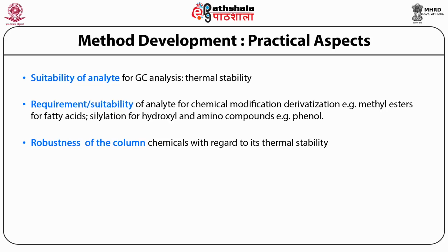determined. And again, there is a wide range of chemicals now available which are part of the column, and the thermal stability of each of these varies. So if the program that is to be run for a particular mixture needs a higher temperature for resolution than the thermal stability of the column allows, then some other column needs to be tested. Then it needs to be determined whether there are elements in the sample that may be corrosive or destroy the column, such as chromic acid or alkali.